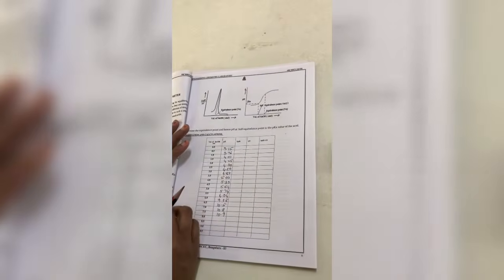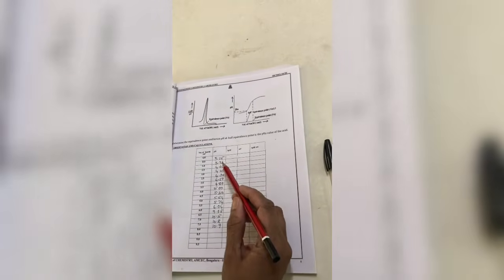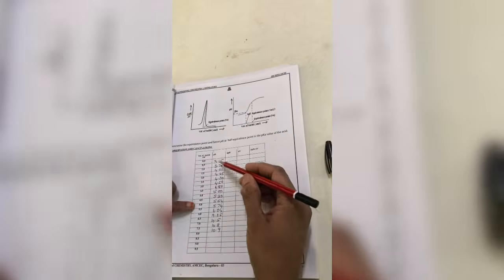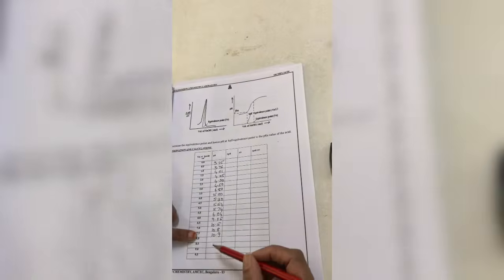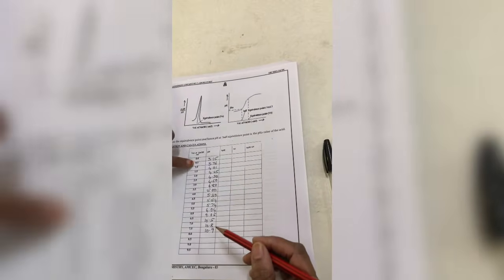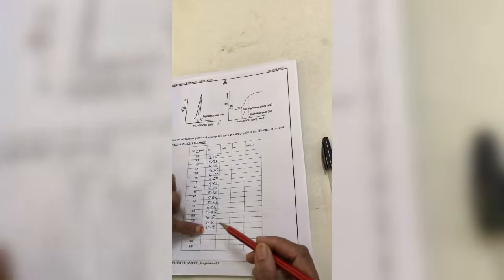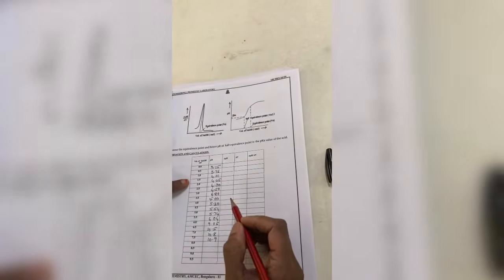Okay, now coming to the second video for the calculation of determination of pKa. Now we have noted down in the tabular column whatever pH we have measured using the instrument here. From 0.0 ml of sodium hydroxide to 7.5 ml of sodium hydroxide we have added. After each addition of 0.5 ml we have noted down the pH of the solution. Now we have to fill this tabular column for doing the calculation part.